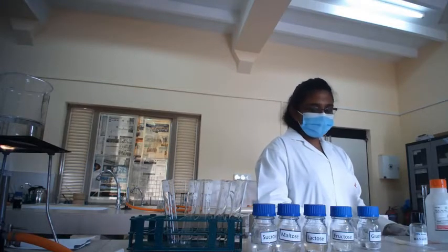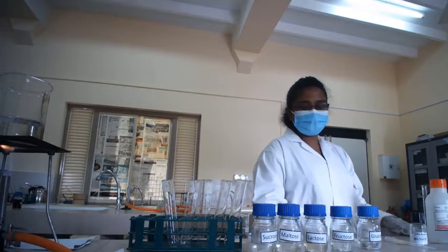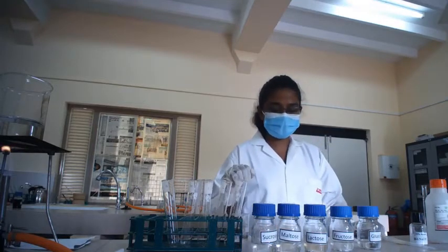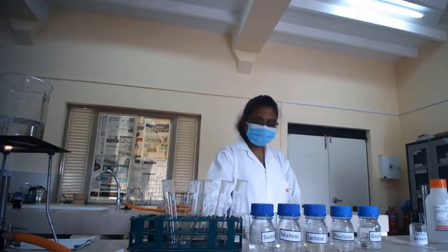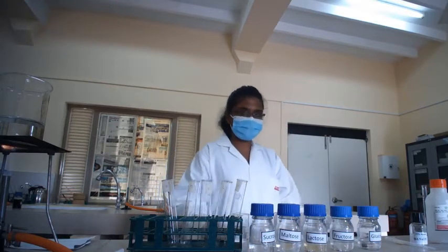Now I am going to make Fehling solution for all 5 carbohydrates: sucrose, maltose, lactose, fructose, and glucose.